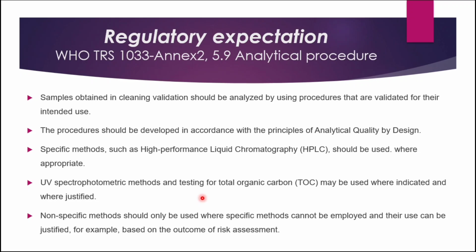What is the regulatory expectation? As per WHO TRS 1033 Annexure 2, 5.9 analytical procedure, regulatory expectations are as below. Samples obtained in the cleaning validation should be analyzed by using procedures that are validated for their intended use. So these methods should be validated, clear-cut message they are giving. The procedure should be developed in accordance with the principle of analytical quality by design. So method development should be in line with the principle of analytical quality by design.